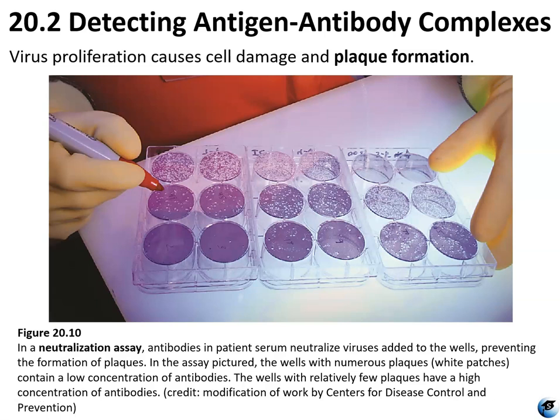And the way that you do that is you get these culture plates and you put a specified concentration of living cells in the culture plate, and you put a specified concentration of viruses, and you do it in a serial dilution. So you have a high amount, a little bit lower, a little bit lower, a little bit lower, just like we saw earlier.